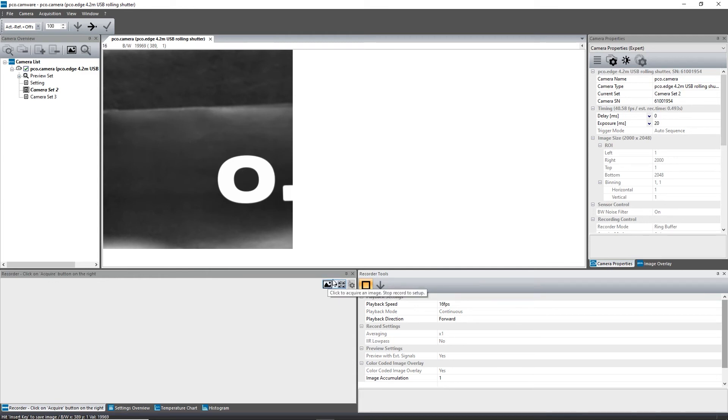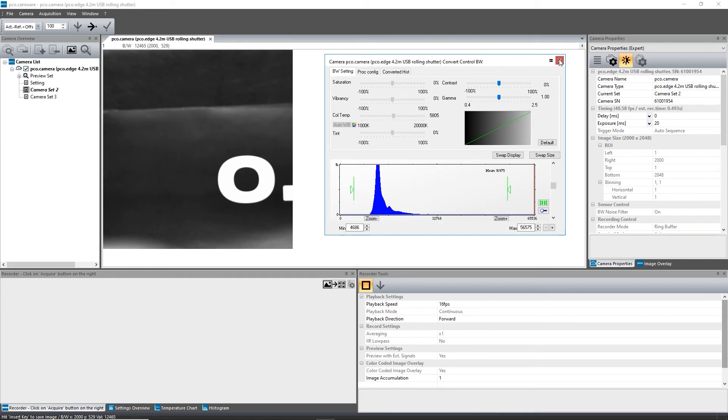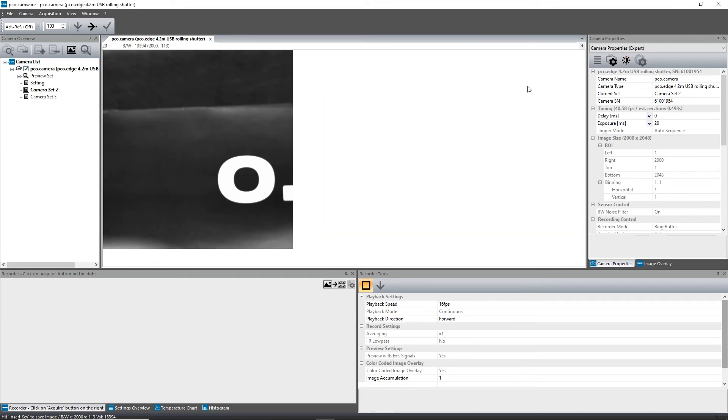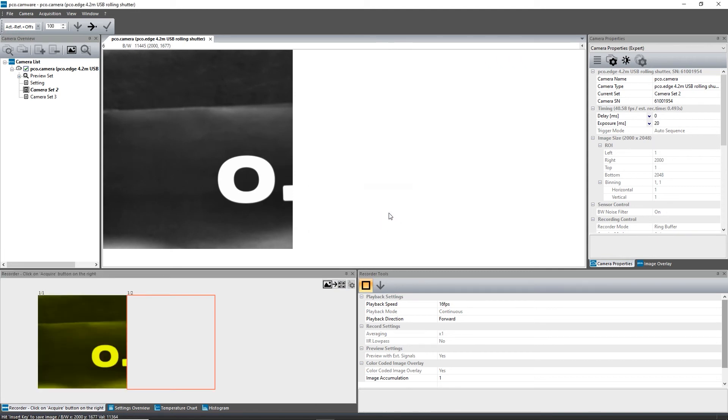In the conversion dialog, you can adjust the settings for the minimum and maximum image values. If everything looks correct, click on Acquire in the recorder. This image is now stored in the RAM of your PC, and camware switches to the next channel.